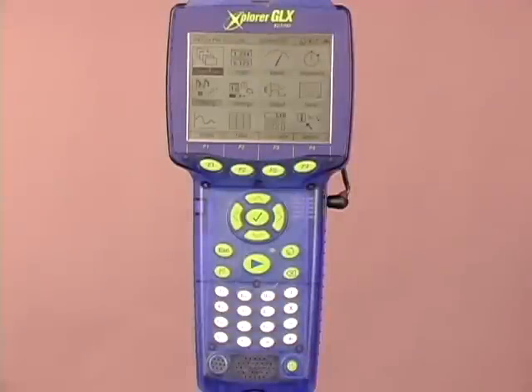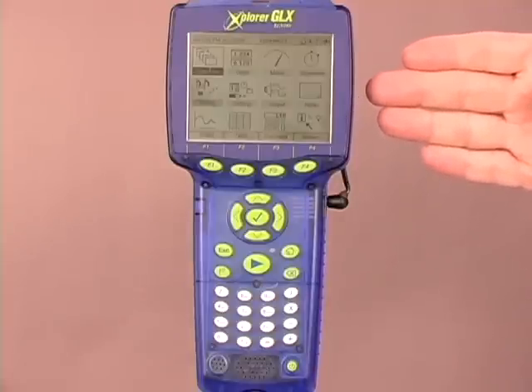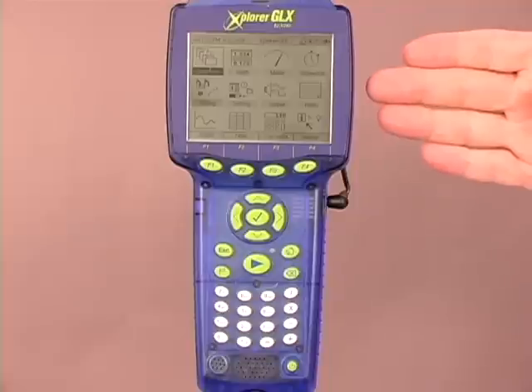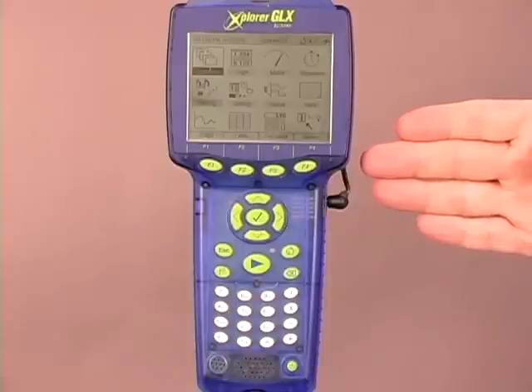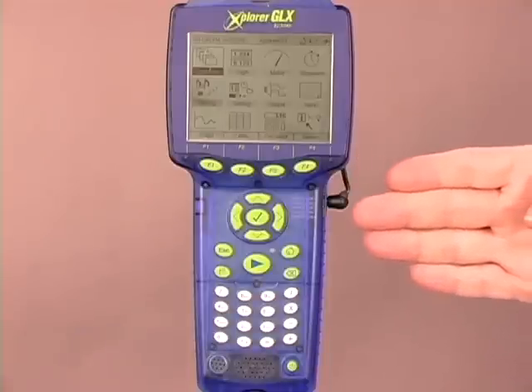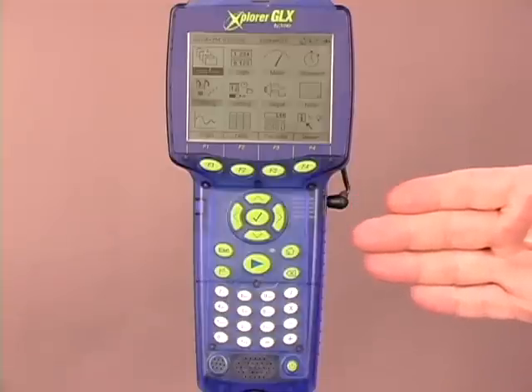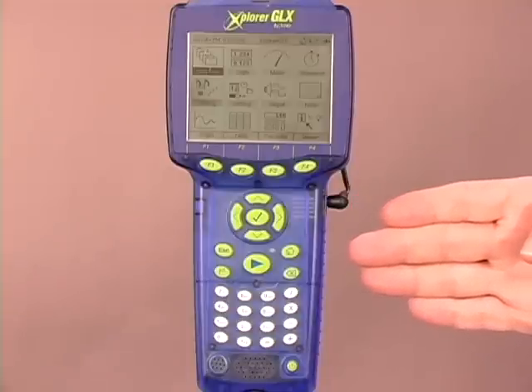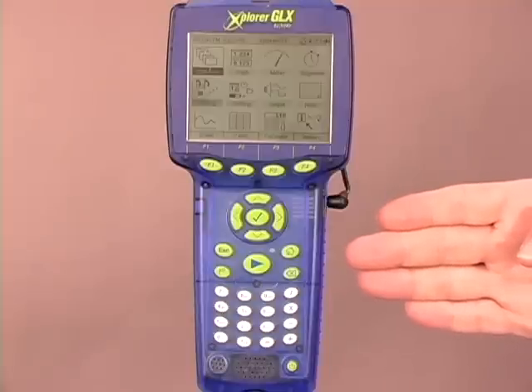Let's take a look at the basic anatomy of our Explorer GLX. Up front we have the screen — a 320 by 240 quarter VGA full resolution screen. We have the function buttons, which are mapped to each individual screen. We have the navigation buttons, which allow us to move around or enter into various screens. We have the basic functionality buttons such as start and stop, home screen, delete, and of course annotation.